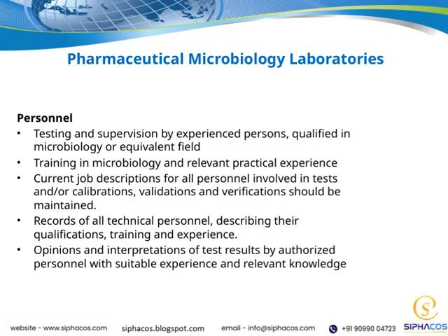It's essential that testing and supervision are carried out by experienced individuals who are qualified in microbiology or a similar field. This ensures that the work is reliable and compliant with industry standards. Training plays a crucial role here. Personnel should have both formal education and relevant practical experience to perform their tasks effectively. It's also important that current job descriptions are maintained for everyone involved in testing, calibration, validation, or verification activities. This helps clarify roles and responsibilities, ensuring accountability.